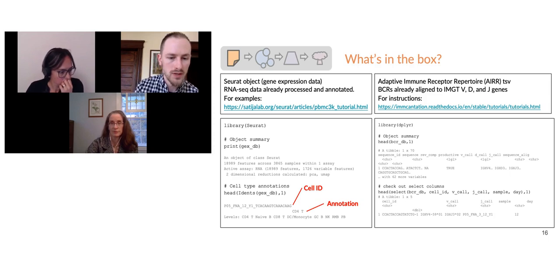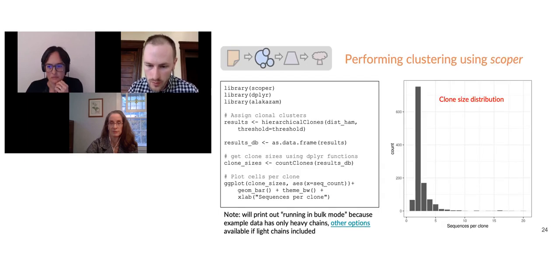How to incorporate light chains to cluster B cells. If you look up Scoper Immcantation, or go to the Immcantation site and select the Scoper icon, it will take you to the documentation site. There's some detail in the package for how the light chain clustering is done. Basically, you infer the clones using the heavy chain information and then split them into smaller clones based on whether the light chain V and J genes are different.